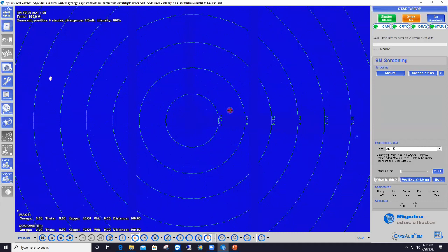And you can see that 47% of you were trained by one of our Rigaku application scientists, and an equal number, 27 and 27, either were trained by your X-ray facility manager or you acquired CrysAlis Pro and taught yourself. Oh, I forgot to share. So now you can see the results. Thank you, Pierre. Good, great. Thank you, Joe.